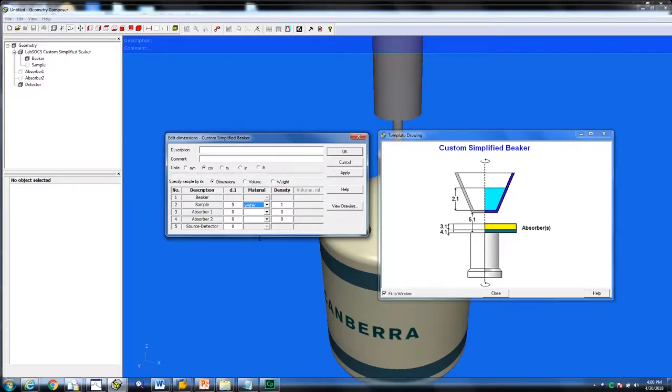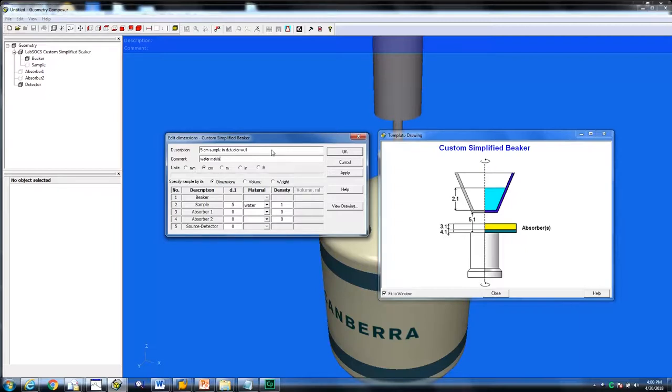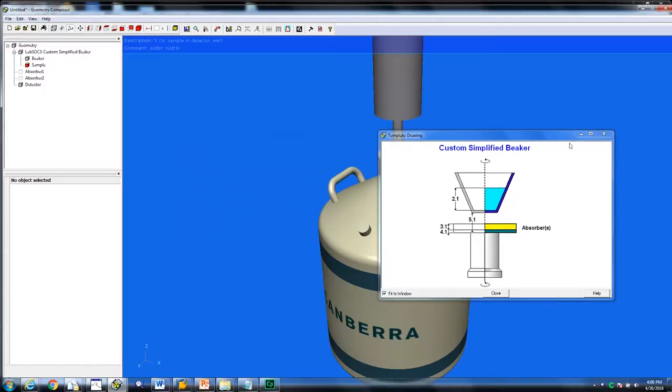A description of the sample can be entered next to where it says description. We have entered 5 cm sample in detector well. You can also type a comment, for instance specify your water matrix. Apply these settings and close the drawing.